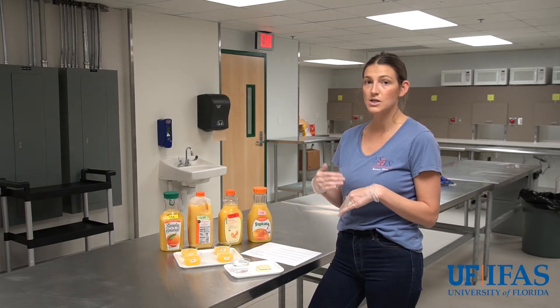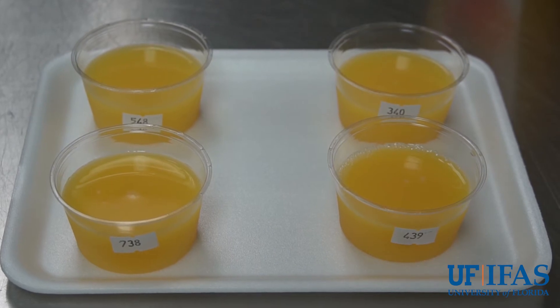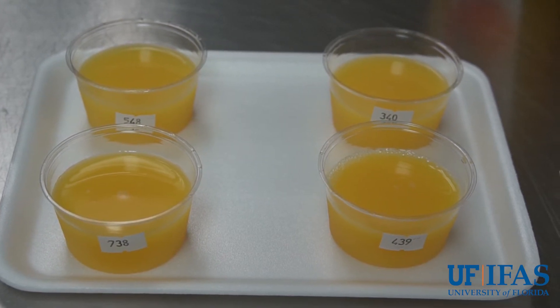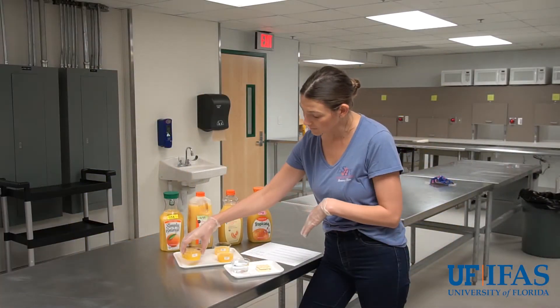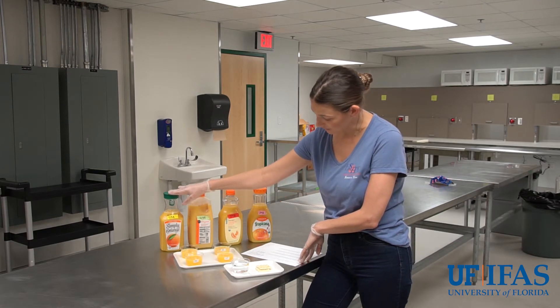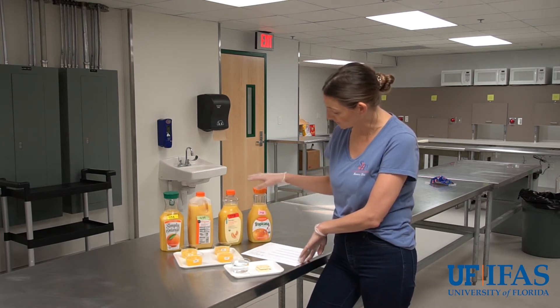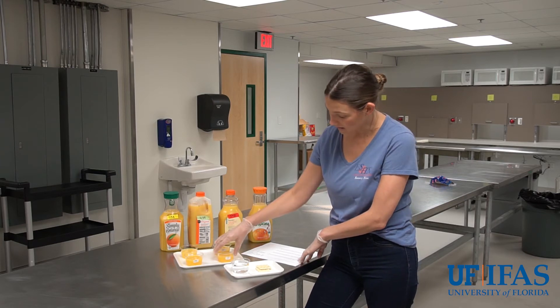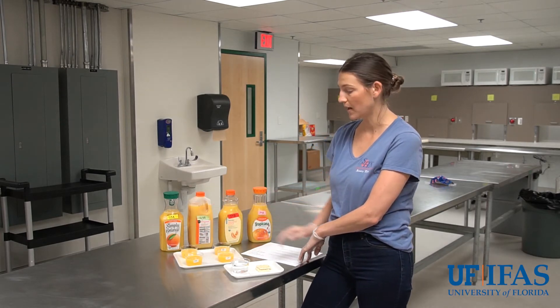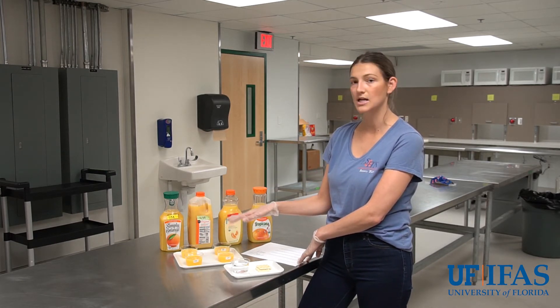To prevent any position bias between samples, we also randomize the order of presentation of each sample on the tray given to the panelists. You can see here each cup has a three-digit code. For panelist number one, they'll get the 700-series sample — Simply Orange juice — first, the 500-series Greenwise orange juice second, the 340 Tropicana third, and the 439 Publix original fourth. They taste left to right in a rainbow shape, and the next person gets a completely different order, which eliminates any position bias.